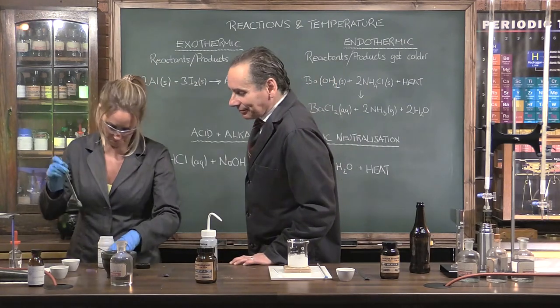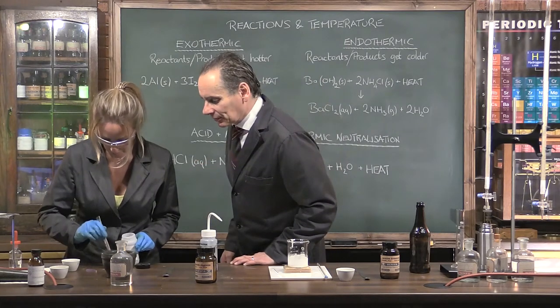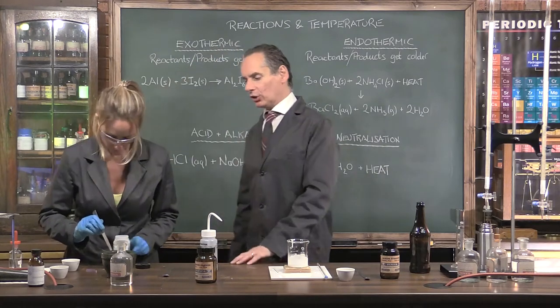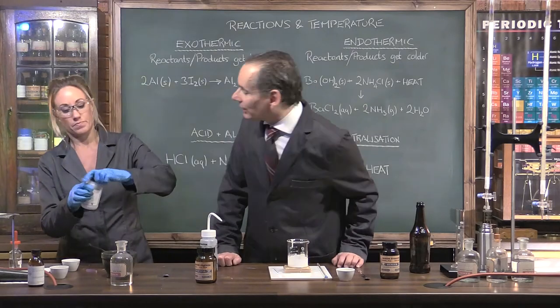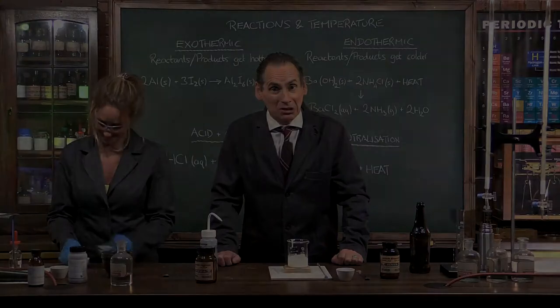And now, about the same amount of aluminium. Fine aluminium powder. That's good. That will be good. Okay. That's smashing. Right, are we ready? Ready. We'll see you outside in just a moment.